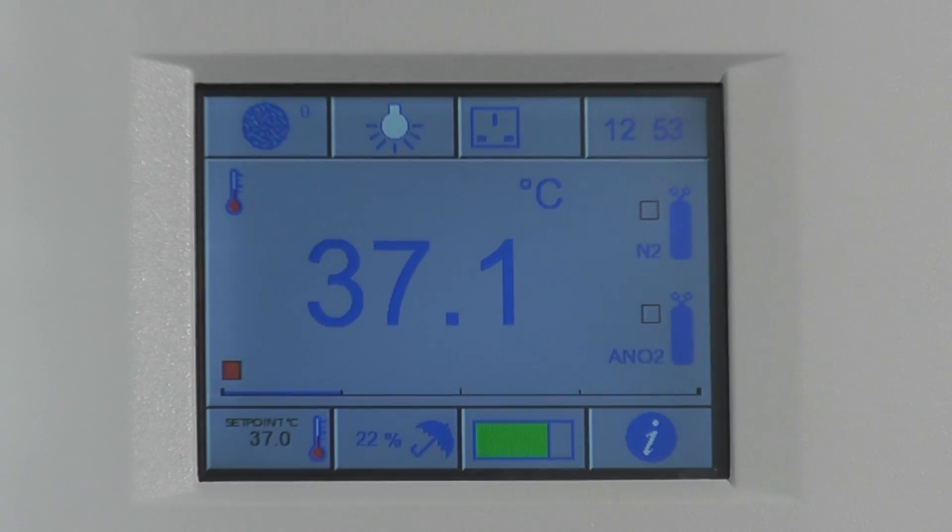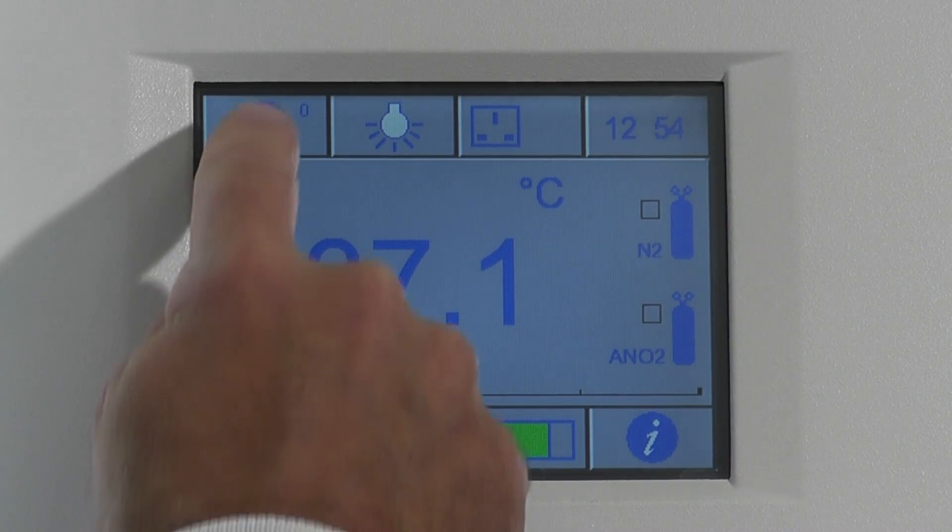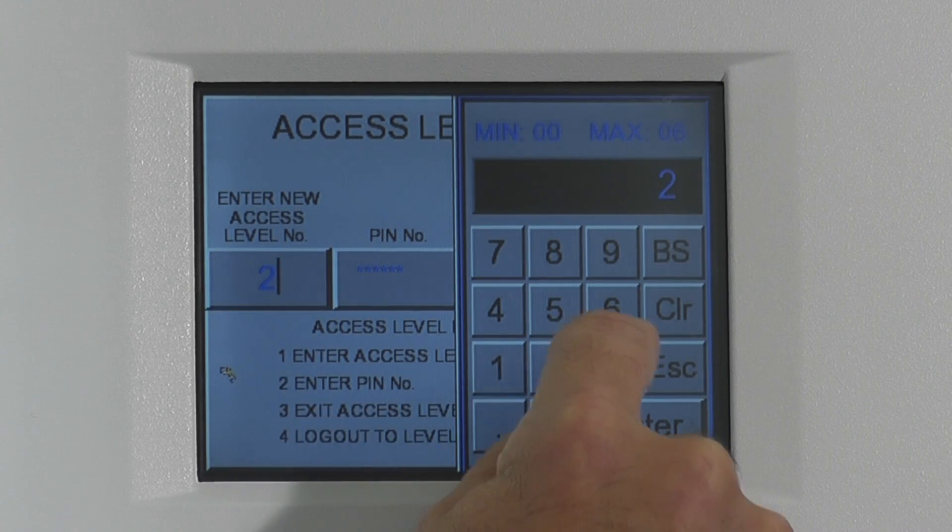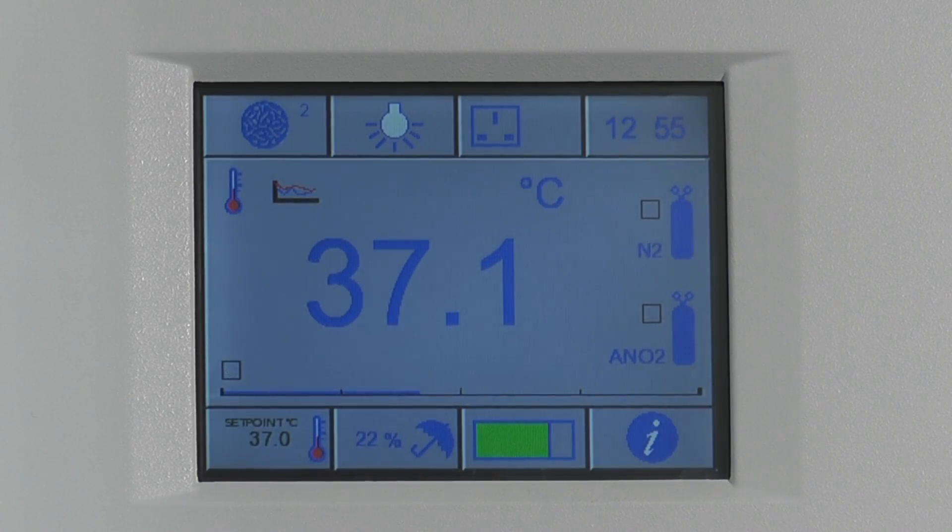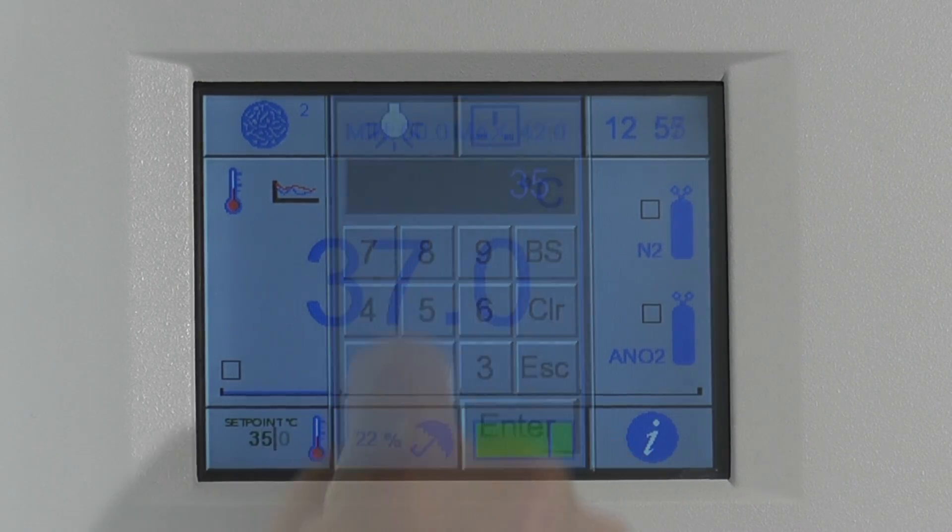The A35 utilizes an innovative touch screen interface with password protected user levels to prevent unauthorized changes to workstation conditions. Temperature and humidity are readily defined by the operator and a history of workstation conditions can be seen at the touch of a button.